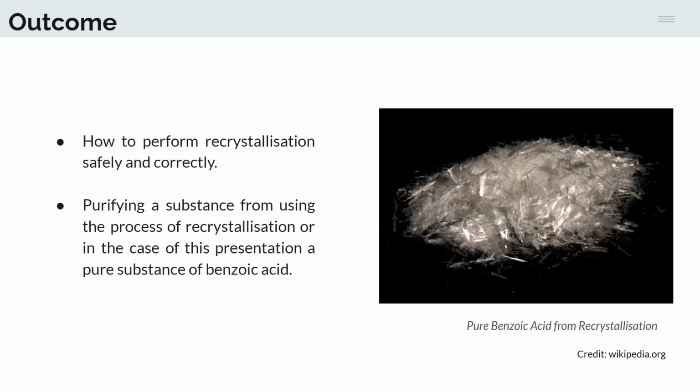In the end, the benzoic acid crystals produced should be pretty clear and fine, and not really a huge amount. But this entire process should now show you how to recrystallize a solid compound, and you can not only apply this to benzoic acid, but a range of other solid compounds for possible future lab work or research, and how to perform this sort of purification procedure safely and correctly.